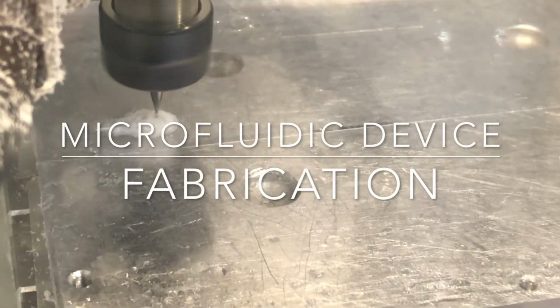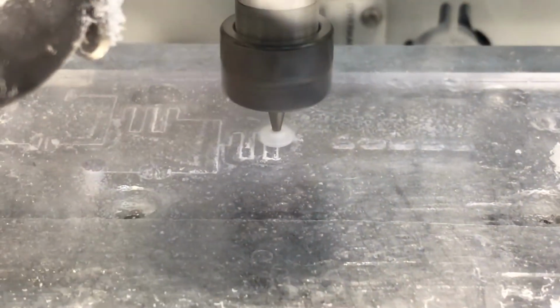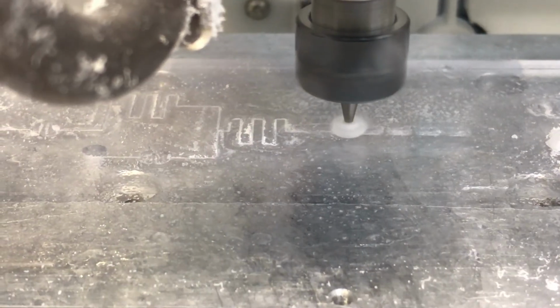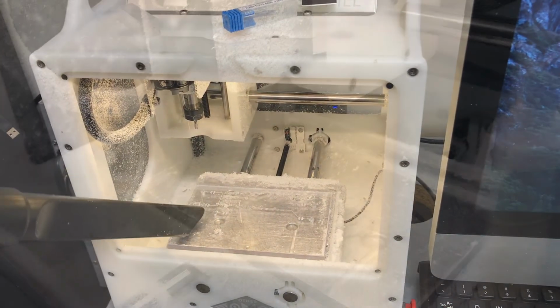What you see here is the first step in fabricating our microfluidic device on the other mill CNC in the CIDR lab. At this point in the fabrication, the microfluidic channels are being milled. You'll see here that there's an accumulation of plastic indicating that the drill bit has become dull. This was a common challenge that we ran into while manufacturing the devices, given that they have a lot of complex parts. With the flow layer complete, we now move on to the control layer.